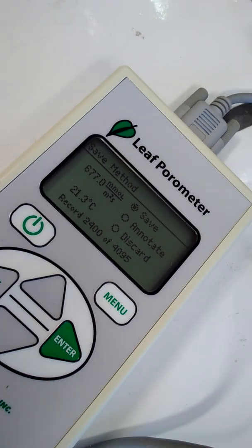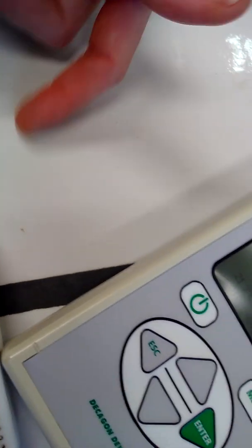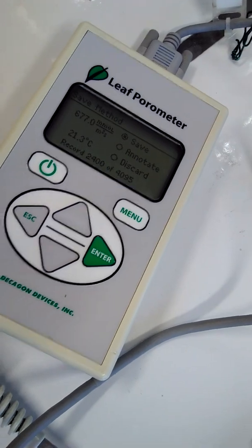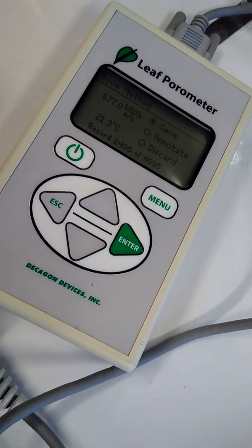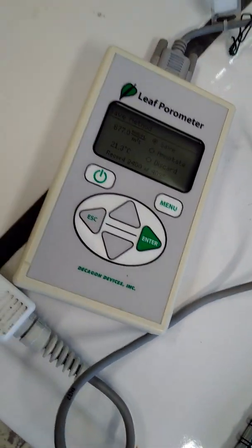Now, of course, this is not a leaf, but still there is some resistance. I mean, there's water on there, but it does not evaporate in a millisecond, not infinitely quickly. There are still some things preventing the water from escaping in no time, so to say. And that is, of course, the thing I already discussed: the boundary layer. Well, it also depends on the other environmental conditions, so the temperature, and in the end, the water vapor gradient between the surface, which has a relative humidity of 100%, and the environment, which has a lower relative humidity.